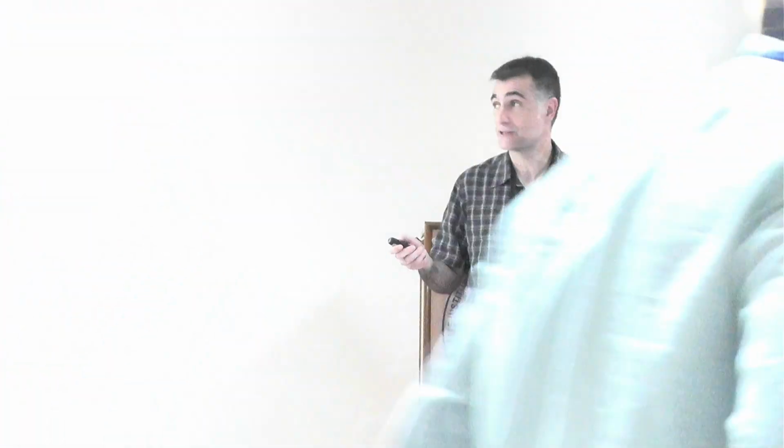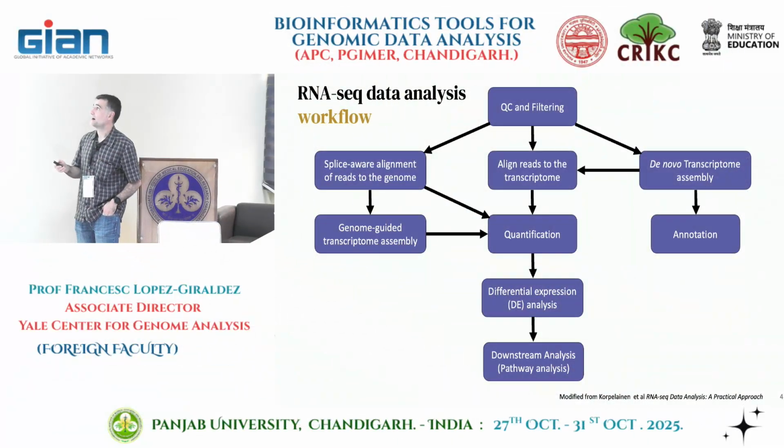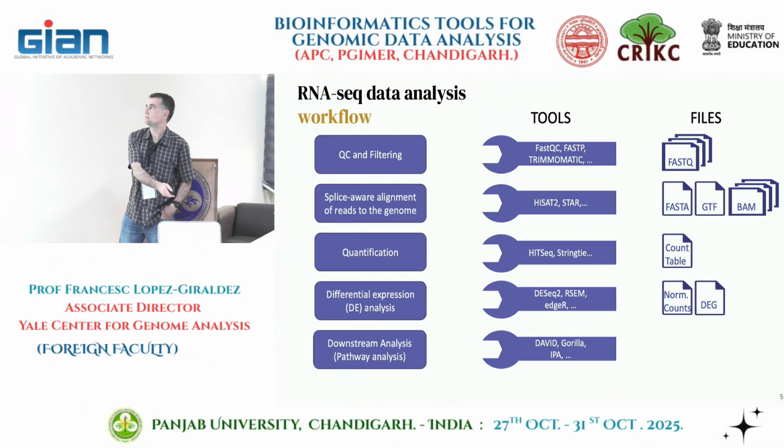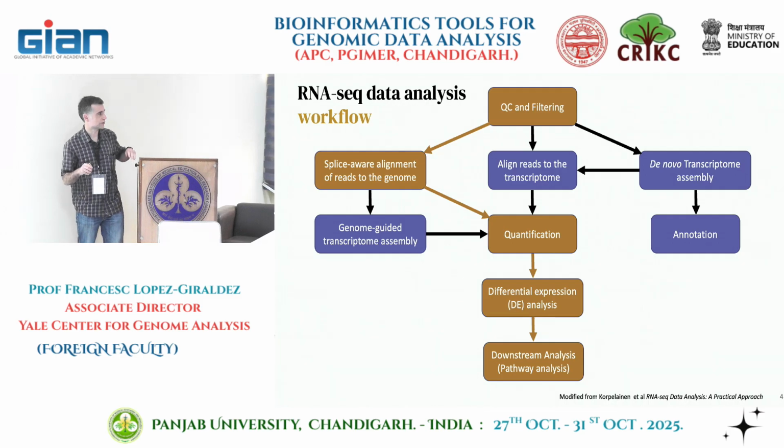You've seen this already. I'm not going to go through it again, right? But this is the process. You need to imagine we have our samples, we went through the process, and we got our FASTQ. I mentioned this before. So these are the steps we're going to be taking today and tomorrow to analyze our data.